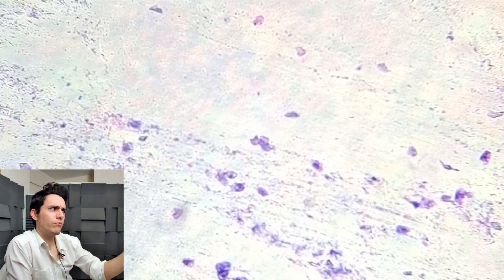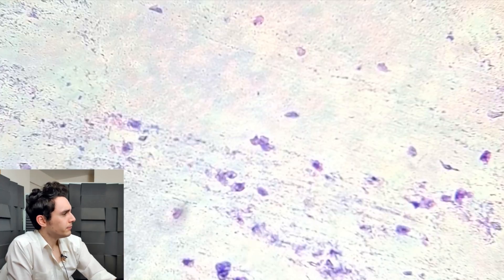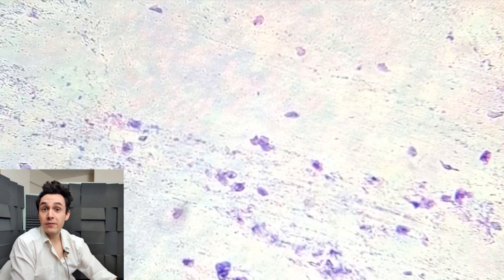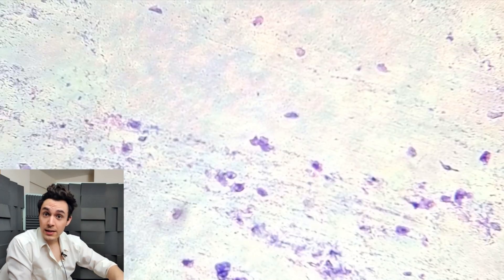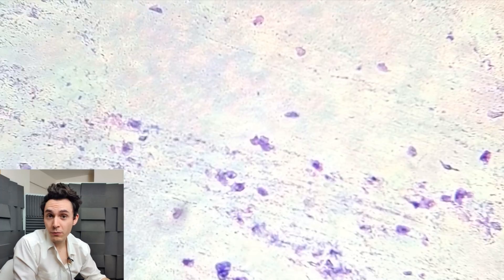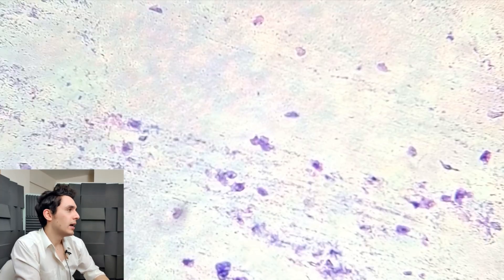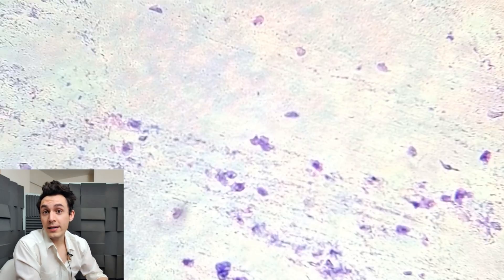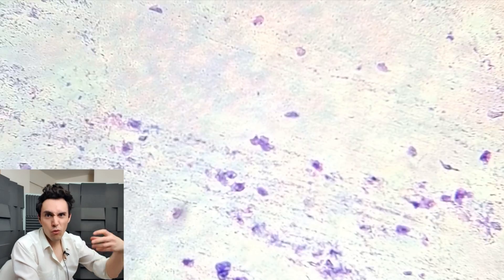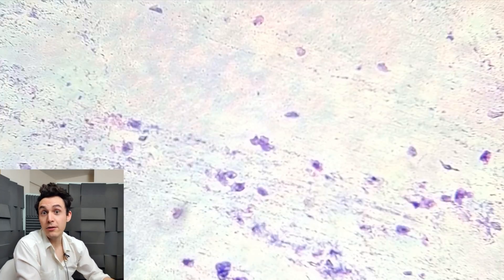What we're seeing here is times 100 magnification. I've done a couple of things to the tissue to make it visible. Once I smeared the dead skin on the microscope slide, I soaked it in methanol, which helps the cells stick to the glass slide and also preserves the structure of the cells.